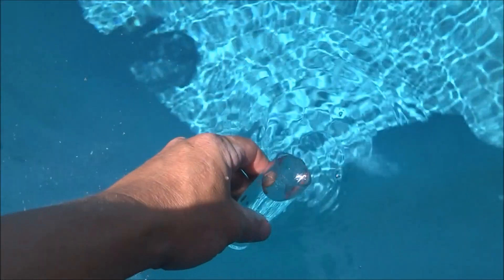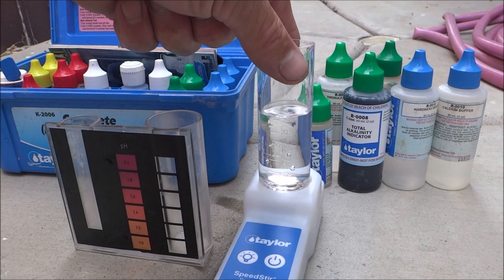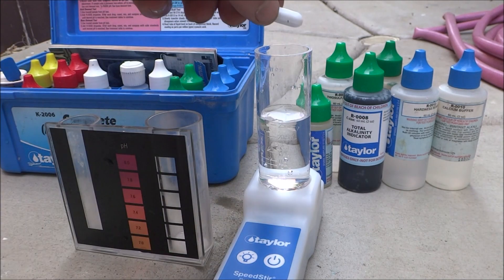Get a water sample and fill it to the 25ml mark. Then you'll take the tube and put it on the Speedster. You would take this weight and drop it in.